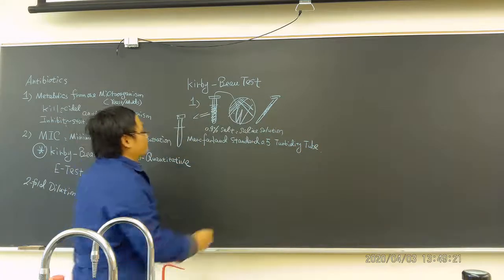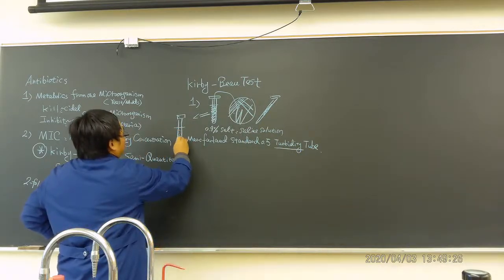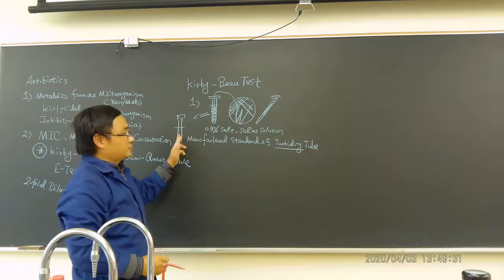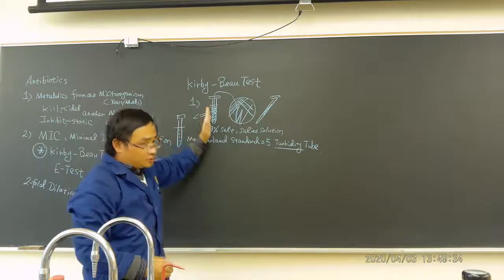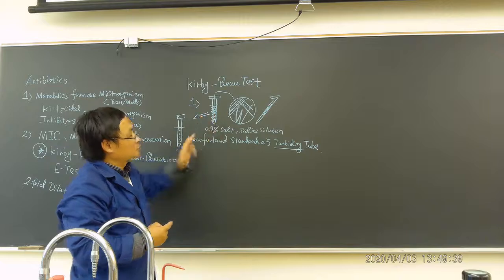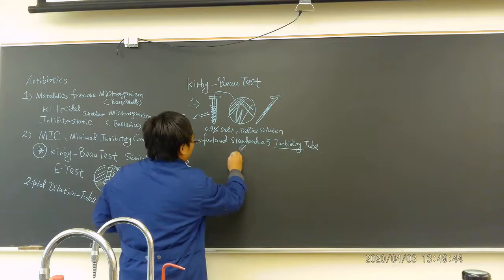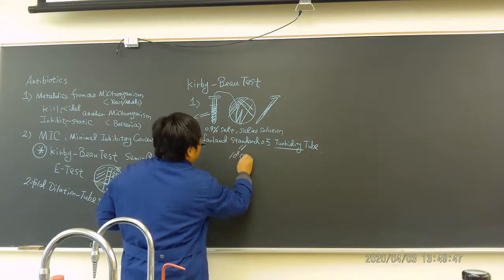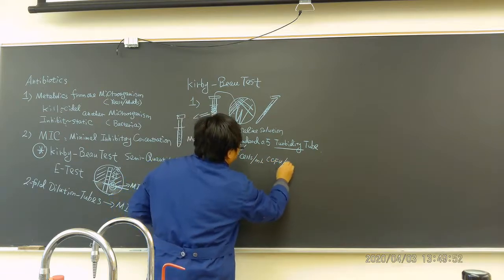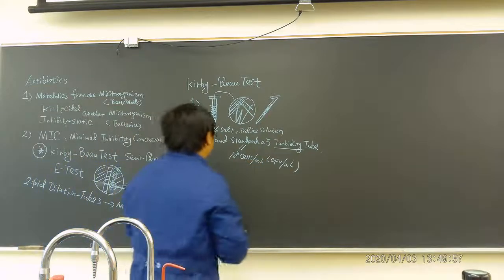We are actually comparing the turbidity. This is a standard McFarland tube. I don't have it, I just tell you we compare this to that. If the turbidity looks similar by eye, the tube can be used. This equals approximately 10 to the 8 cells per ml, which means CFU per ml. That is a standard. This is the first thing we do.